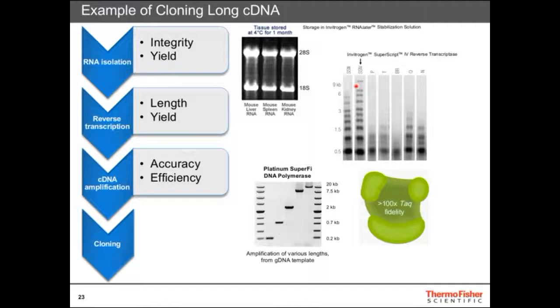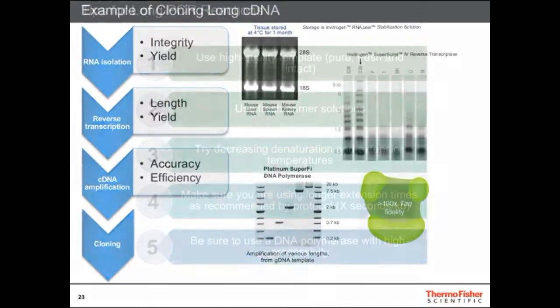So we purified this band, and then we did PCR, and you can see in this image where the PCR is. So again, you're getting nice, clean amplification. And then we purified this band and we cloned it. So we were very successful in starting with tissue and getting our 6 kb fragment to clone.